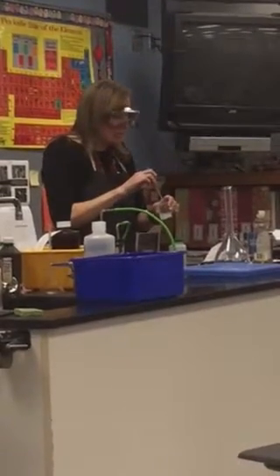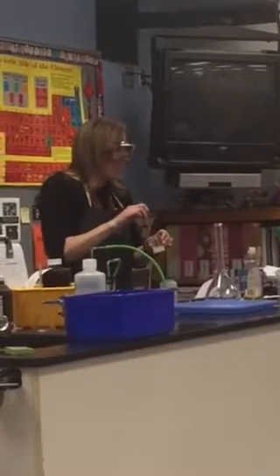If I added the catalyst directly to the hydrogen peroxide, it would cause it to decompose rapidly and we would see lots of bubbles of oxygen gas. But that's not cool. We want to see it better. So to make the bubbles forming bigger, we're going to add soap. The amount is really not critical, just a lot.